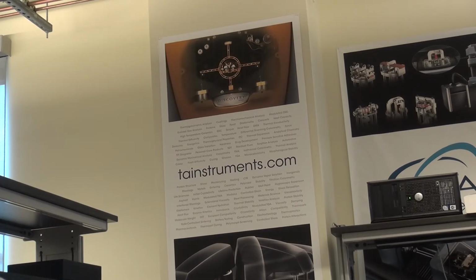Can you say again the function of the reference pan? It's measuring as a reference weight, right? So it's a counterbalance system. If one side is heavier than the other, it'll tilt to one side, and that tilting corresponds to a specific mass of material, the difference between the reference and the sample. For example, my reference pan is always empty, so the reference is just an empty pan.